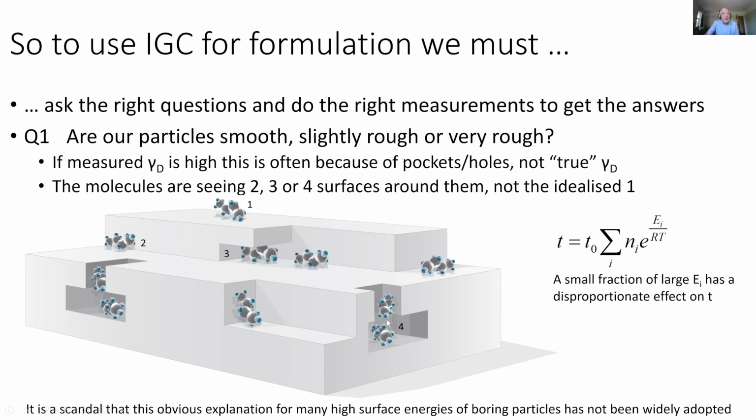Now here's the thing. The retention time depends on the interaction energy, EI, of each of these particles, but it's an exponential. So a small fraction of particles that go down holes are going to have a very large influence on the average retention time. And when people just do simple surface energy measurements, they have no idea of this. So it's a scandal, in my view, that this obvious explanation for high surface energies of boring particles has not been widely adopted.